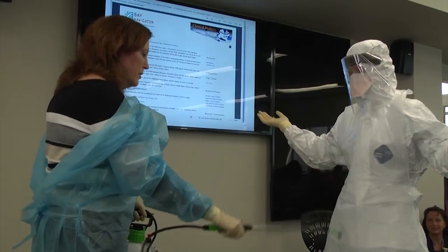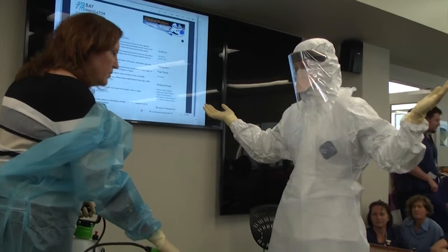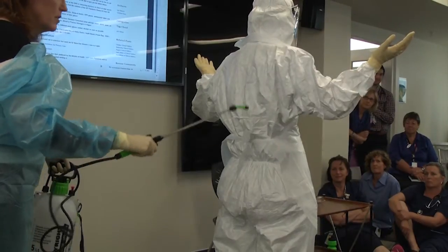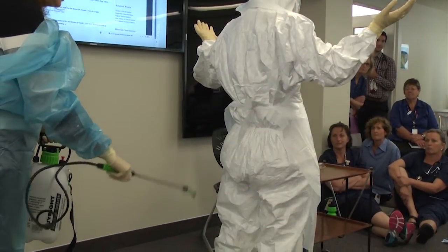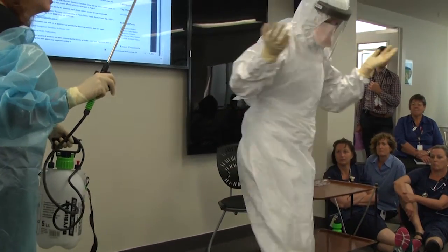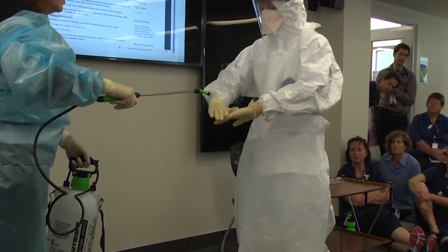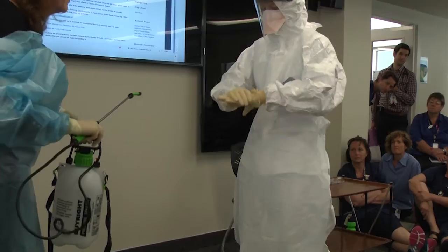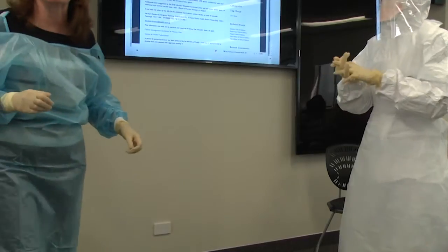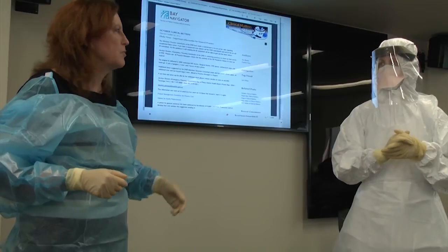You spray down all visible surfaces including hands and feet, and as you do this you inspect for any soilage, tears, or contaminated areas. Go ahead and turn around again — and hands, and over. Generally you need to wait a couple of minutes; it will tell you on your guide for whatever disinfectant — two minutes by the clock.